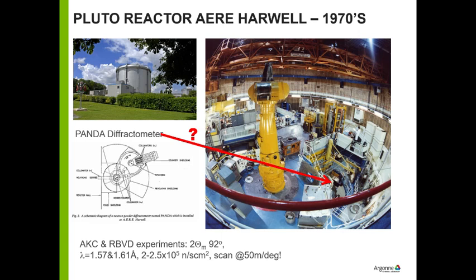It took 3 days to collect the powder pattern for each one. And this is done at liquid helium temperature, so we had to go back every once in a while and refill the cryostat. And it was, I believe, my recollection isn't so great, somewhere down in this pit next to the reactor. Yeah, that was the scan.